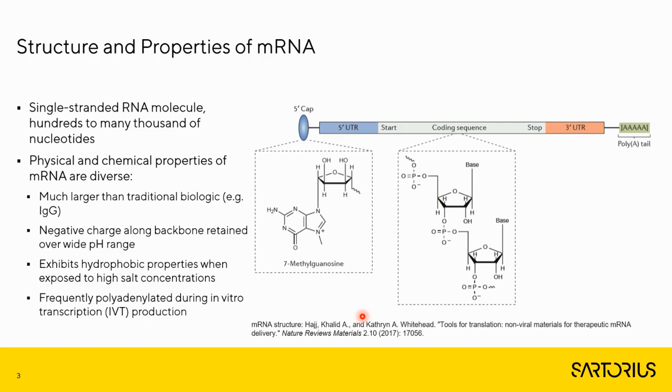Apart from the size, what also characterizes mRNA, sets it apart from other biopharmaceuticals, is the charge. mRNA contains a very, very strong negative charge, I think stronger than most people appreciate. We are in the very low units of pKa, and we have to take this into account when purifying it.